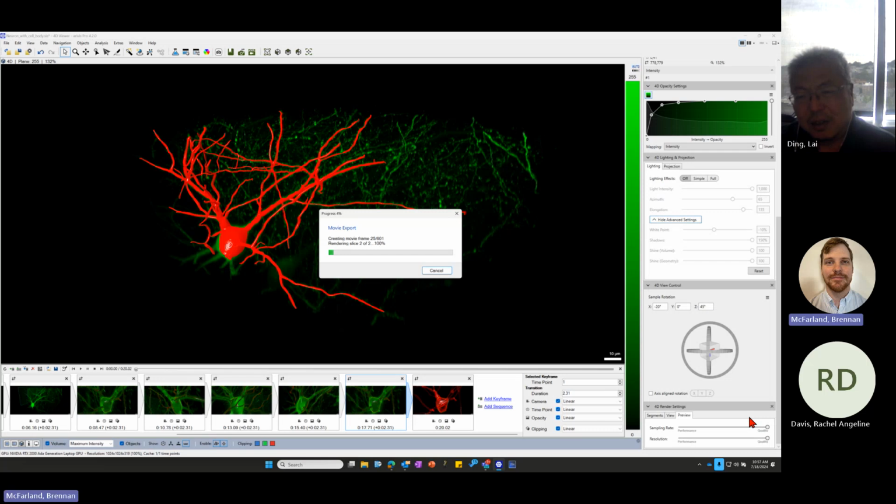It does have to generate and create this movie, building up all these keyframes. So that's why I would probably recommend going with 1080p, because even past 1080p, most people don't have a resolution to see that extra pixel information anyways. If you want something to look a little bit nicer, I would probably just increase the frames.